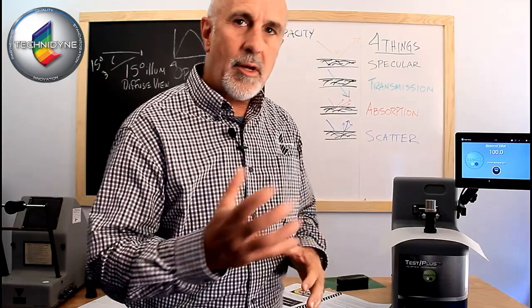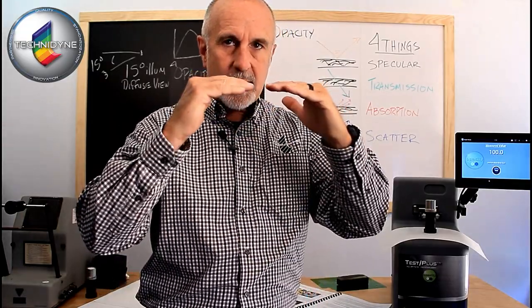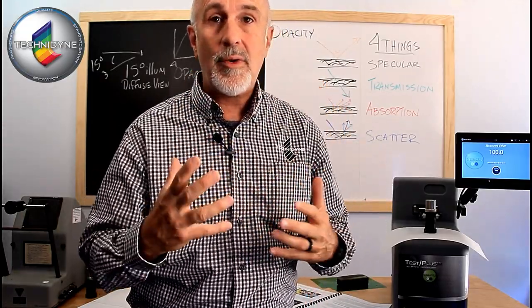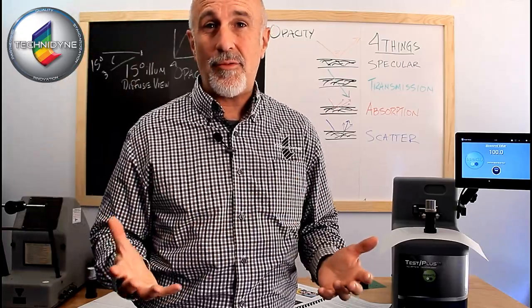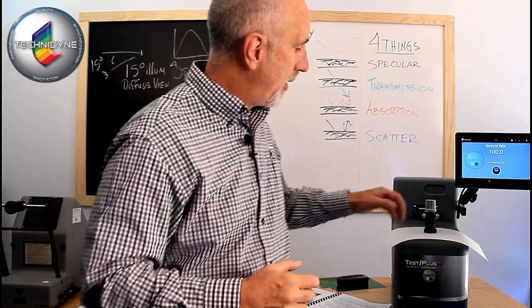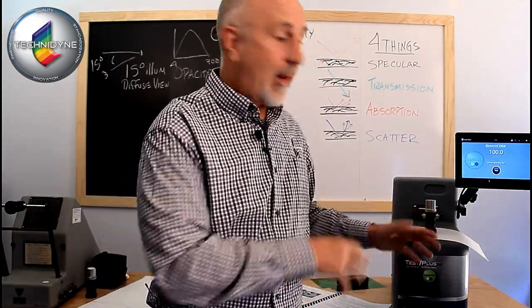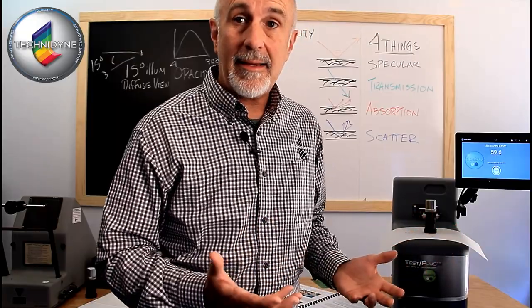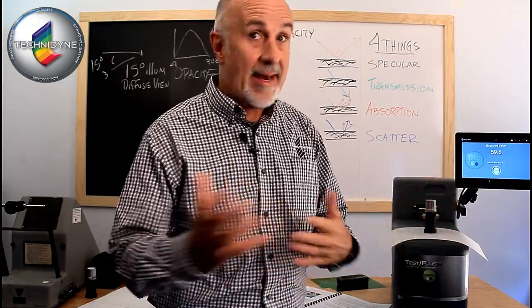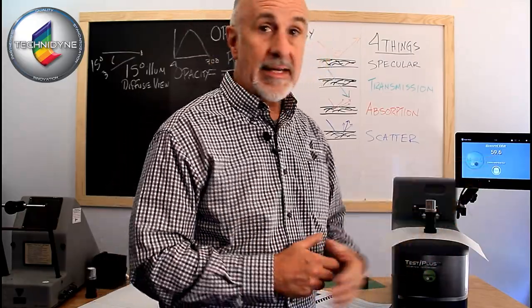So when it loads the white body, what it does is it takes that and sets that to be 100%. So we don't have to do the calculation of R0 divided by R89, it just does it for us by doing that ratio real quick. So we now load the black cup, we hit test, and if this was 100% opaque, that would read 100, but it's not 100% opaque, it's 59.6, so it doesn't have a high opacity to that sheet.